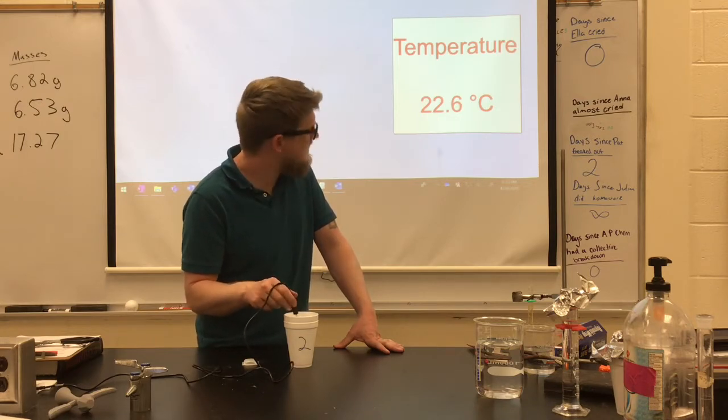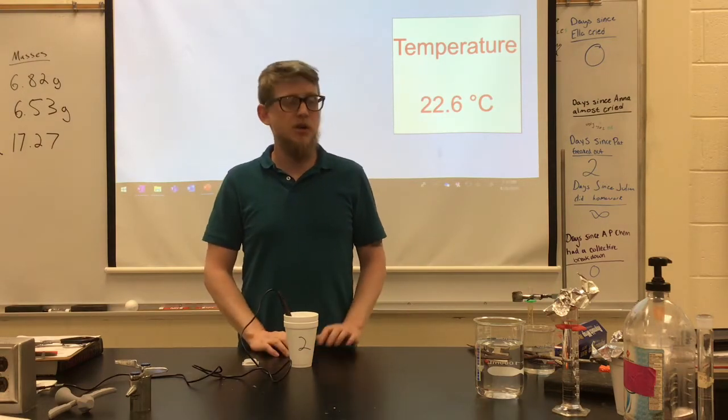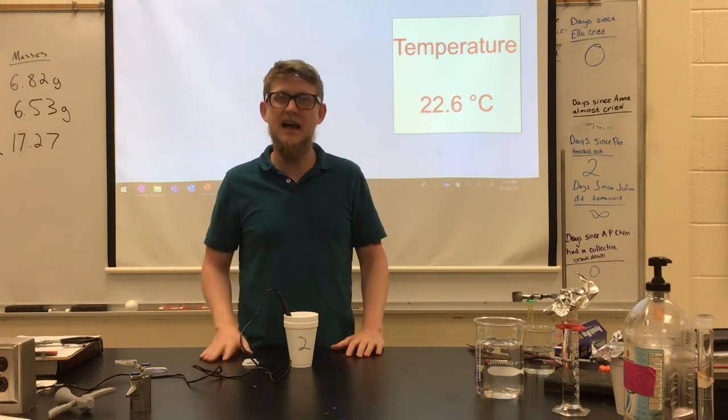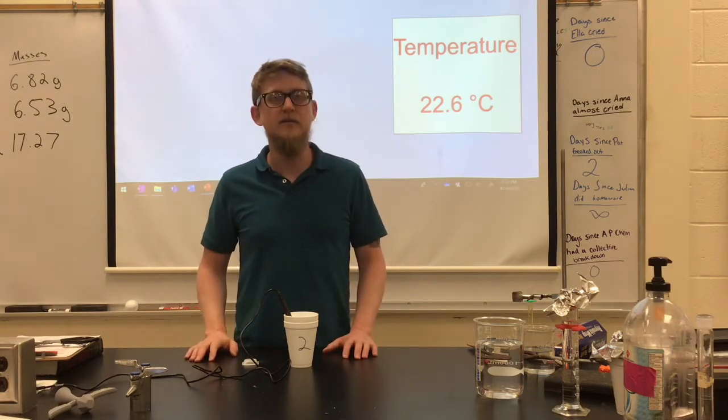Hopefully you see there that when we did this, the temperature went down, all right? So the first experiment released heat, right? And we saw the beaker get hot, right? The surroundings get hot. That's an exothermic reaction that has a negative sign for delta H.